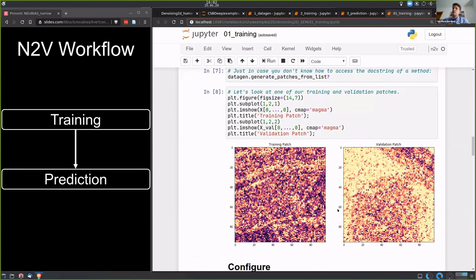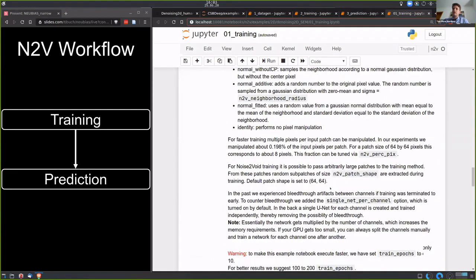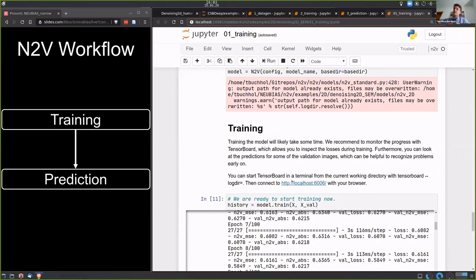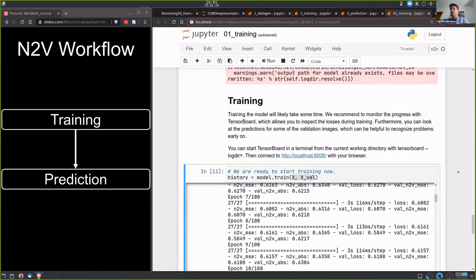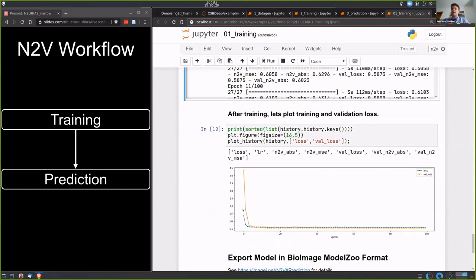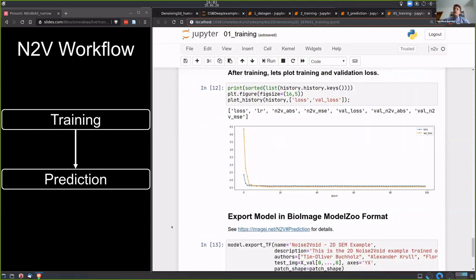Once you have the patches, you create your network and start training by passing X and Y to the train function. After training you get the loss curve plots. Even though they look converged after a few epochs, you really need to train for many many epochs because Noise2Void training keeps improving over time. Training for four to six hours or overnight is really the best you can do.